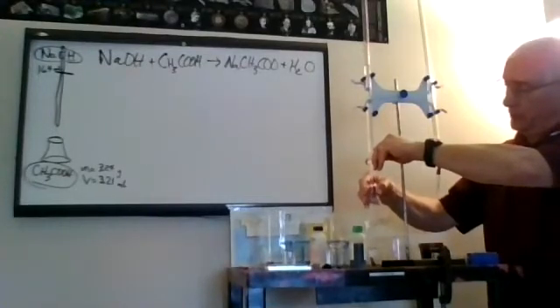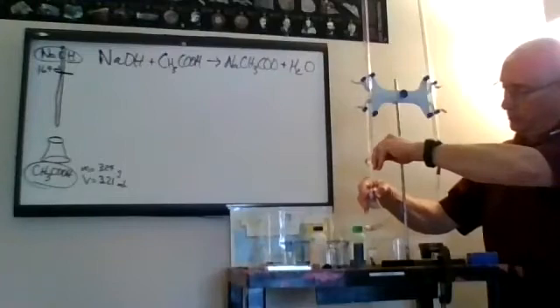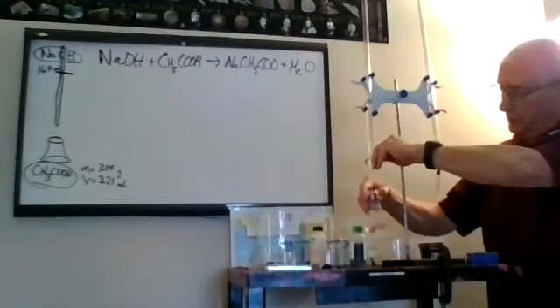I'm starting to get a little pink. Whenever it splashes in there, it gets a little bit pink, so I know I'm coming close to the end point of titration. You watching me? I hope so. Whoa, I'm able to swirl it out. And when it takes like 20 seconds to swirl it out, you know you're reaching it really close.